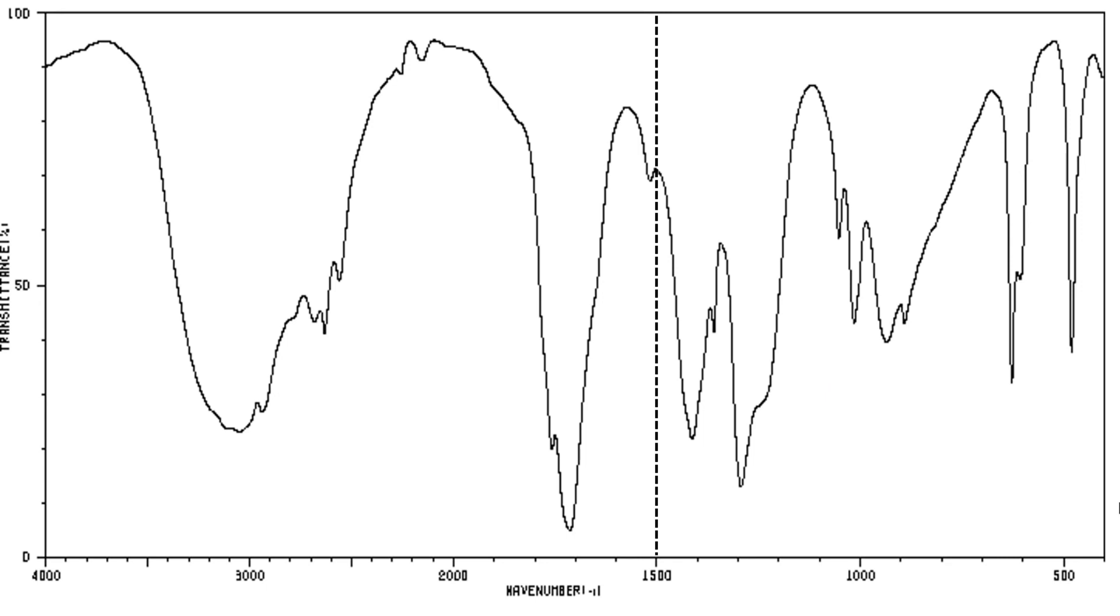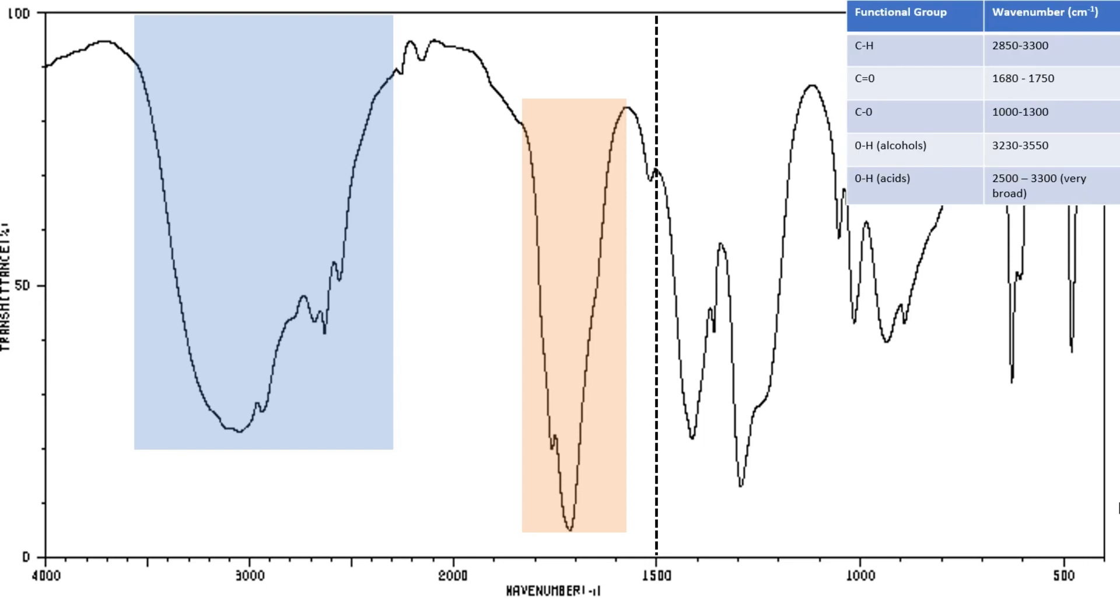When I start to do the analysis, I always draw a line at 1500 to help me work out which is the fingerprint region and which is the functional group region. Then we look in the functional group region, and we can see various peaks - there's a peak there, and there's a peak there. So we start interpreting and understanding what these peaks are actually telling us. This is where we refer back to the data that we had earlier.